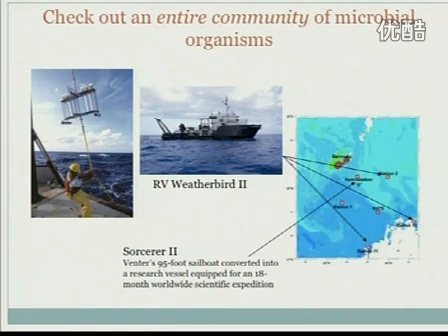Some labs extract DNA from those samples, and those DNA samples are sent to a sequencing center so that you get a lot of DNA sequences from a mixture of microbial organisms. So that's the whole point. Instead of getting reads from a single genome, you get DNA reads from a collection of different genomes.